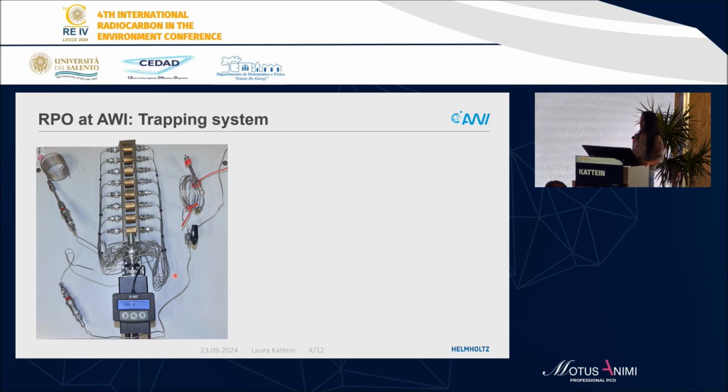So if we conduct a pyrolysis run, we identify the fractions we want to separate, and then we use this little remote to guide the gas stream accordingly over one of these traps so that we can trap every single fraction on an individual trap.